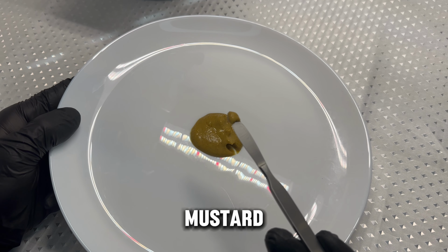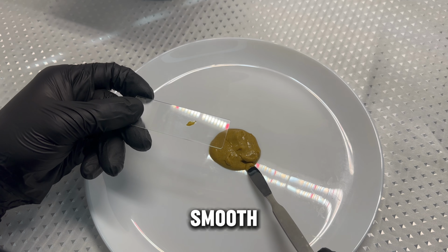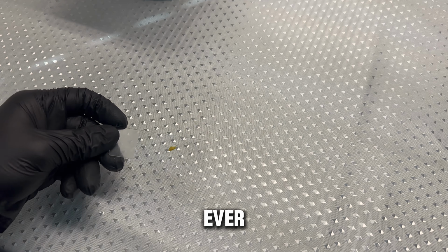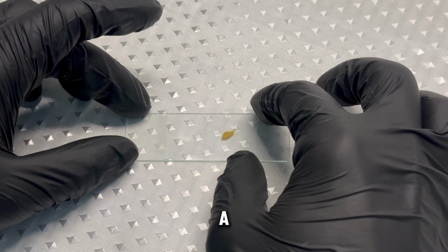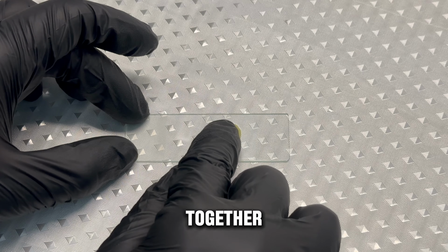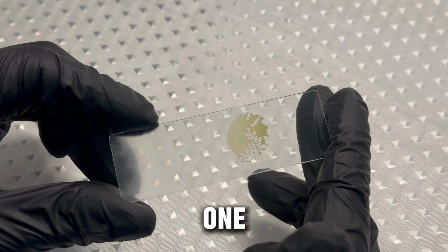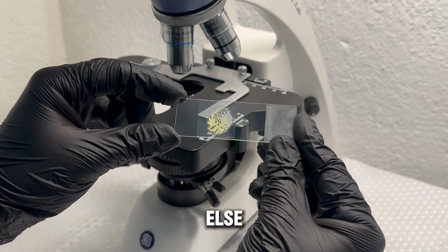When we look at mustard, it seems simple. Thick, yellow, smooth. We squeeze it from the bottle or scoop it with a spoon without ever thinking about what it is made of. But mustard is not just a taste. It is crushed seeds, liquids, spices, and reactions combined together. Everything is blended so well that our eyes see only one uniform surface. But the microscope sees something else.